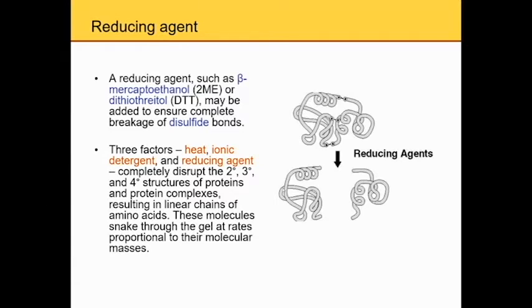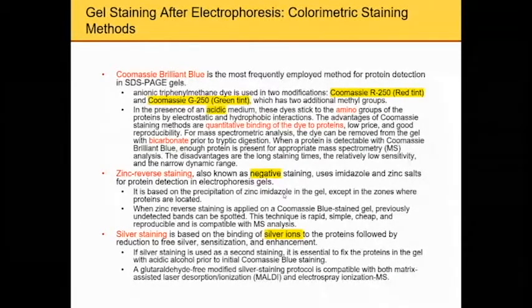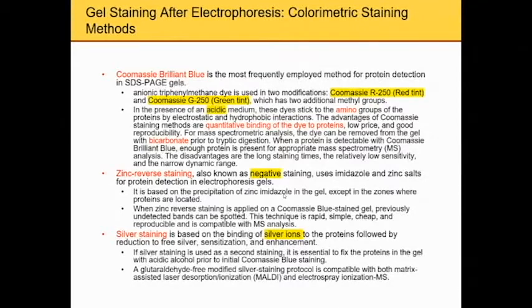That's for the electrophoresis. After the electrophoresis, in order to visualize the protein, we can use a different staining technique to visualize the protein on the SDS-PAGE gel.